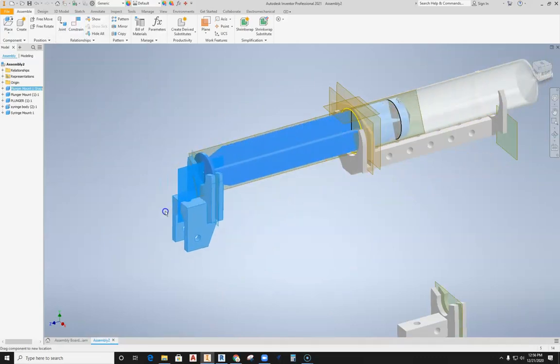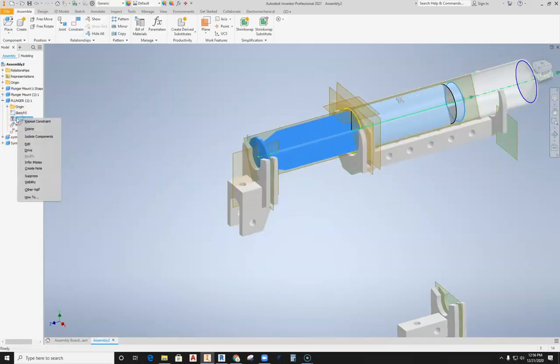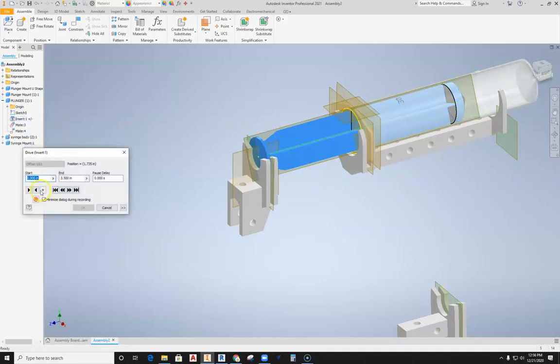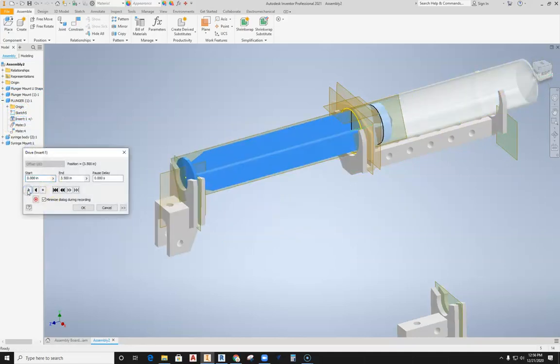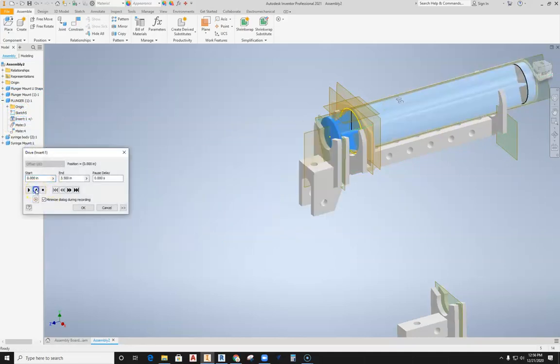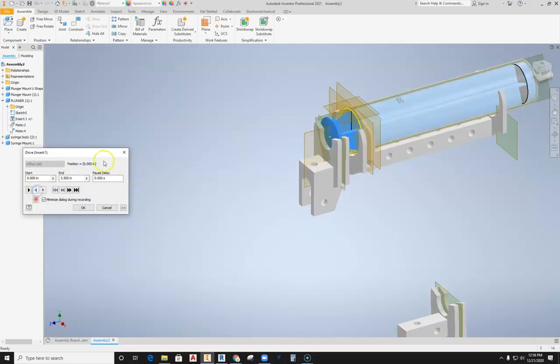So if I were to come over here and then I right-click on that insert, hit the drive tool, you can see that now my plunger is actually functioning off of the drive.